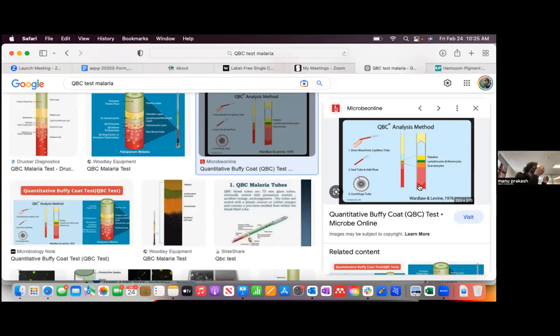Does that make sense? The same volume that was in that tiny little thing is actually now between two coaxial cylinders. And again, going back to, I want to make sure I highlight ideas in frugal science. It's such a simple idea, but it's quite beautiful because now you have granularity and you can look at every one of the layers. They separate out in one shot. You don't do anything.